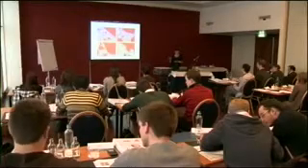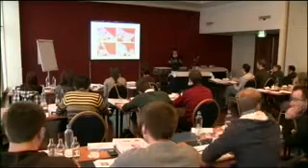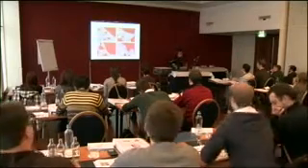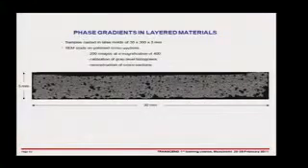So you can have standard routines, you can put your sample in your microscope, you can collect say 200 images, which is typically what you need to get a good representative analysis. It takes about 2 hours or so to collect the images, and then you can analyze these offline, and it can all be done really fairly quickly and routinely. The other thing you can do, you can really get an idea what's happening over a whole sample.